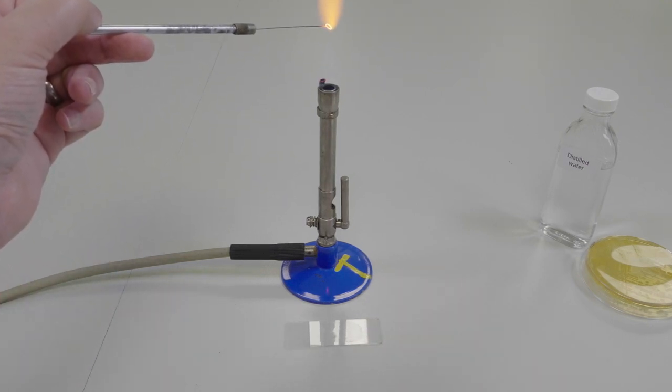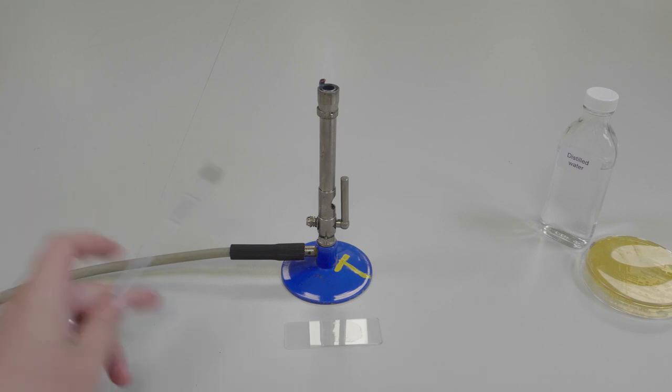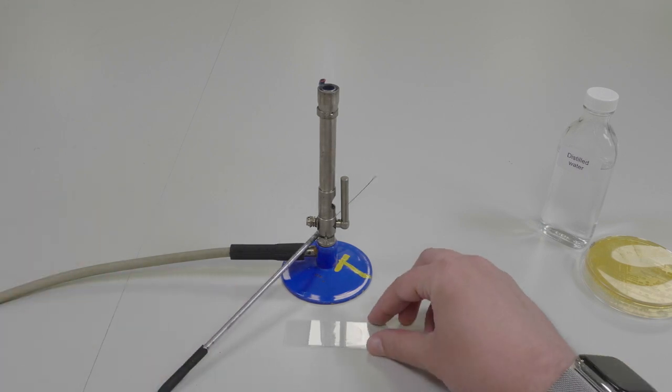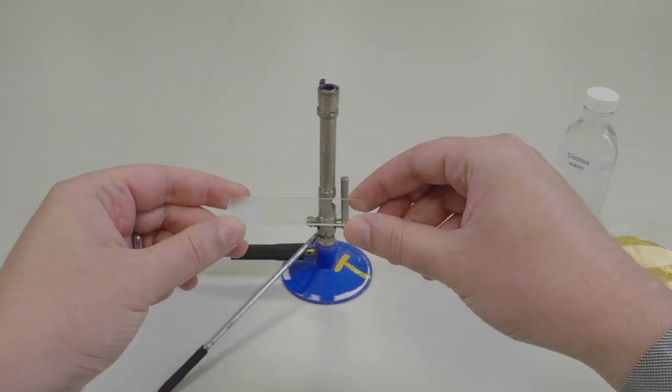Sterilize your inoculating loop and allow the water to evaporate from your slide. This should take approximately two to five minutes.